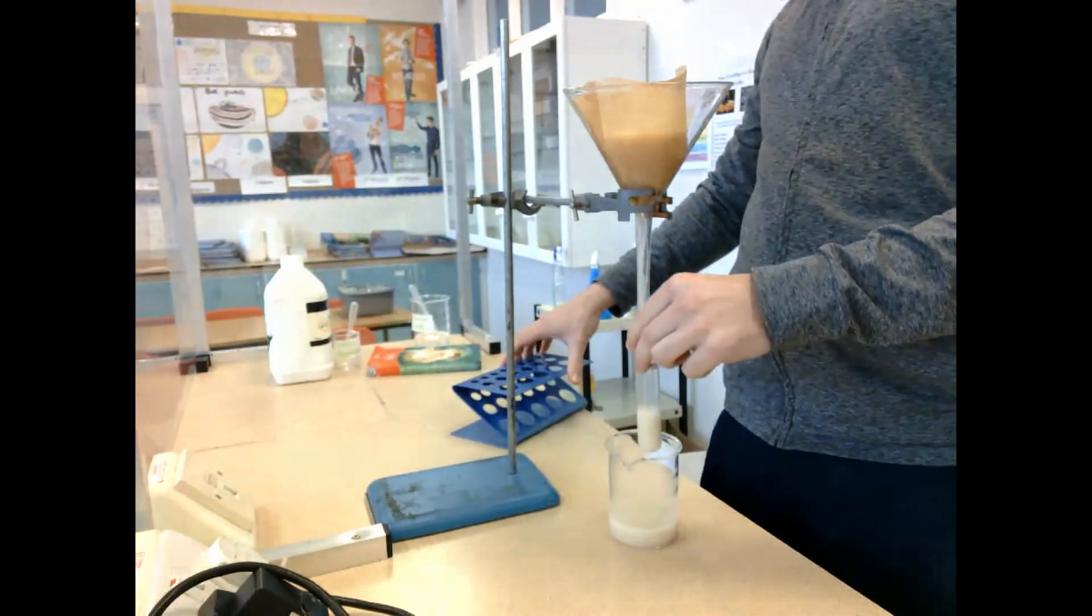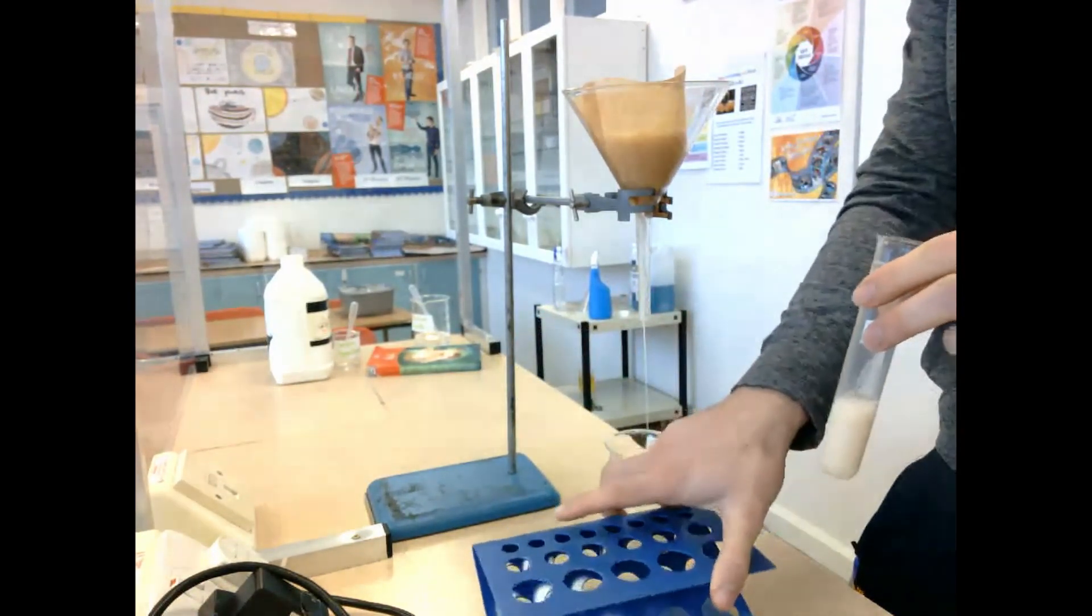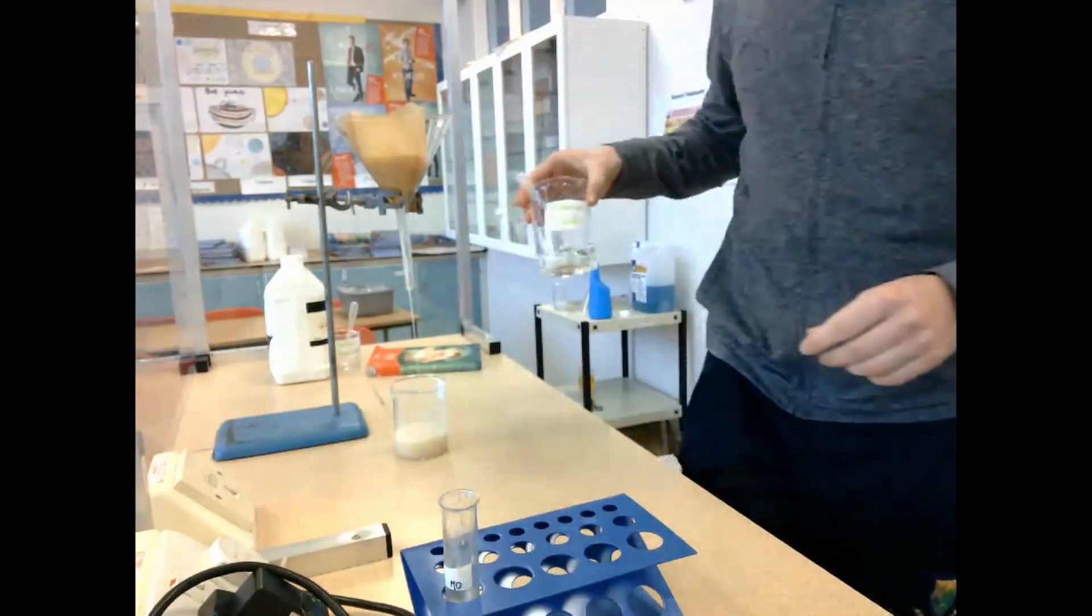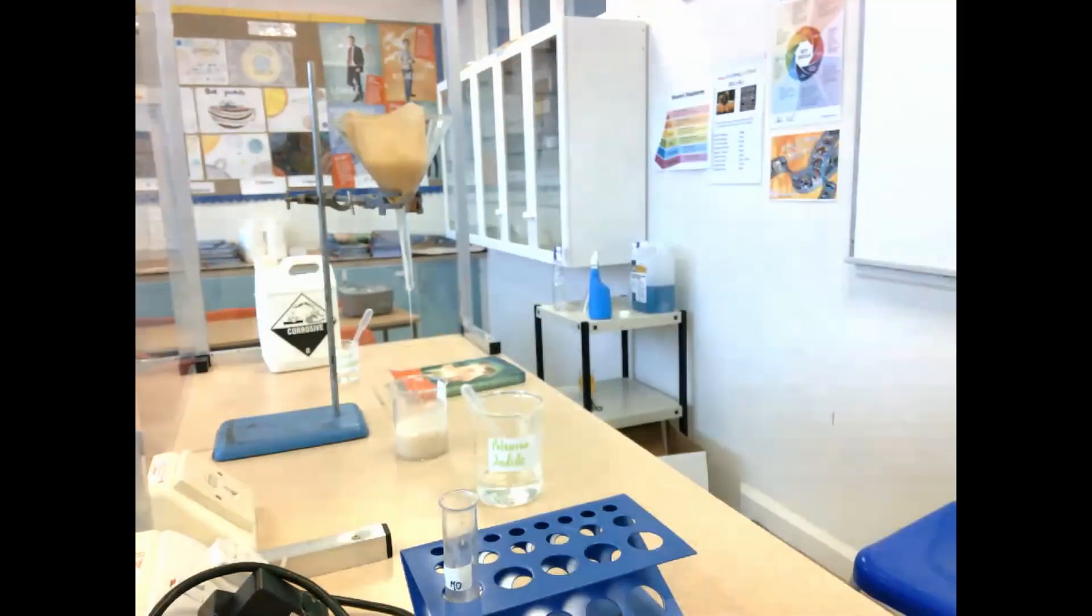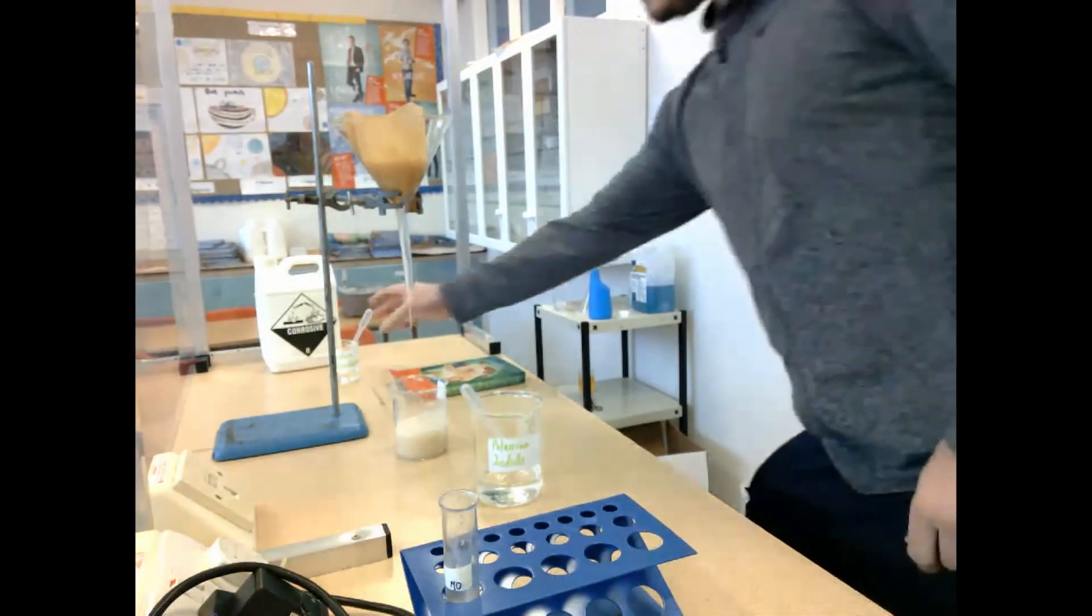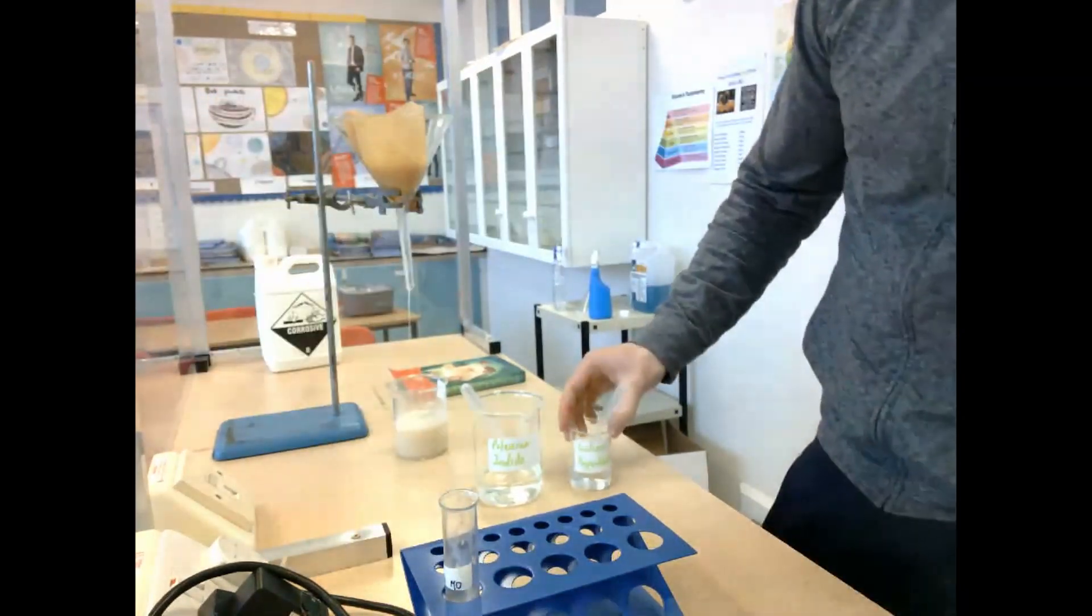Once we're pretty happy we have the filter going, we're going to take a test tube and gather some of that filtrate. We're going to fill the test tube about halfway and then place it into a test tube rack. We're going to get ourselves ready to test for the presence of alcohol, because we need two chemicals to do that: potassium iodide and then sodium hypochlorite.